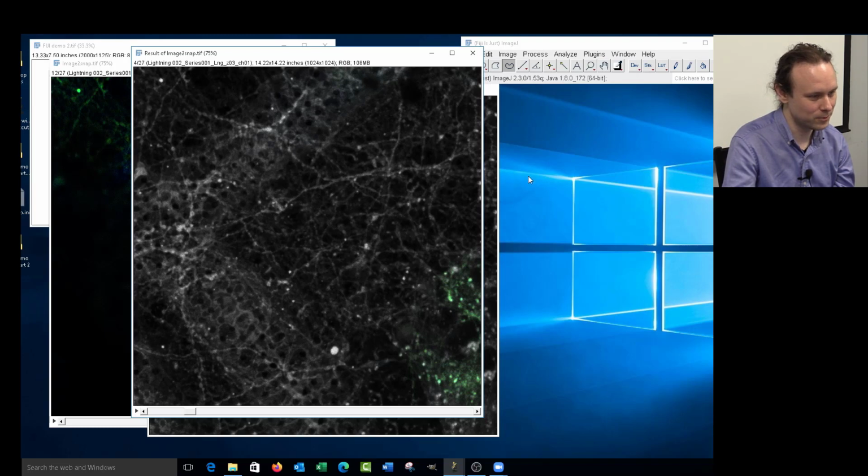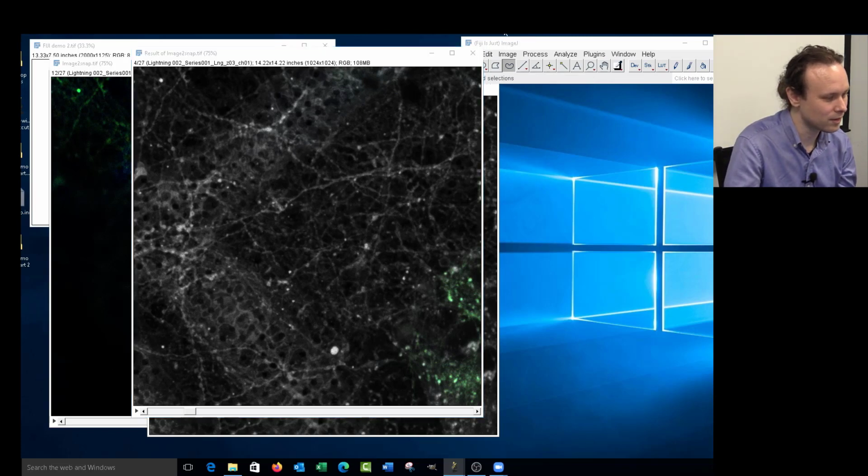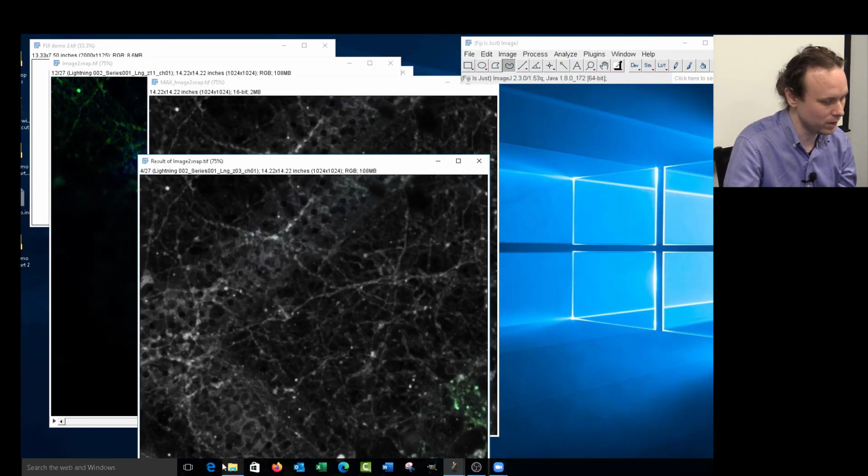Okay, I do have an extra question about the segmentation. So when you do the segmentation in black and white images, you can also get the intensity measurements. Yes. In that segmentation, right? So it's not just for, I don't know, electron microscope, for area, but also for intensity, right? Yeah. So here, I'll bring the screen back up. Yes, so for electron microscopy, it will just read the brightness value of the pixel.